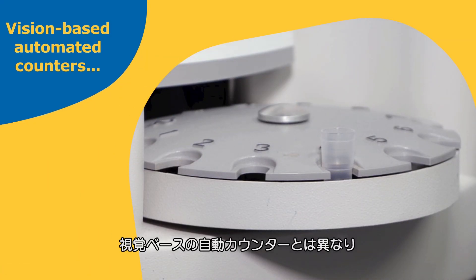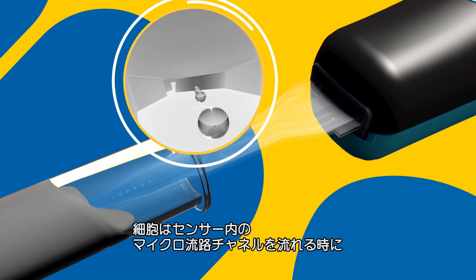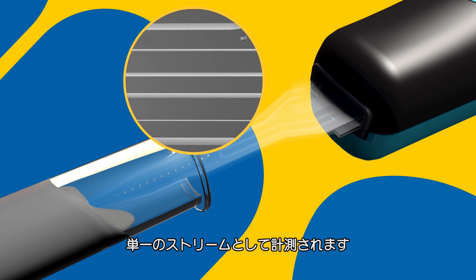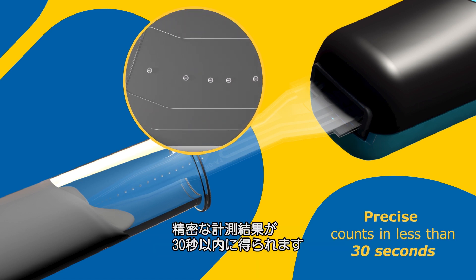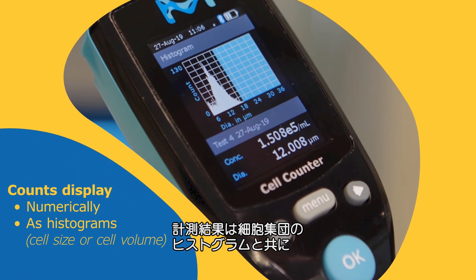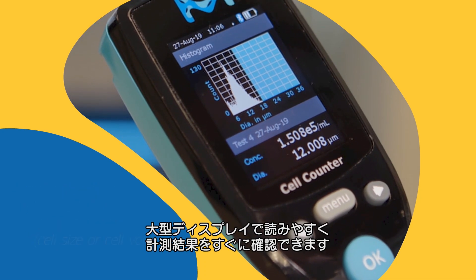Unlike vision-based automated counters, no special and potentially toxic reagents are required. Cells are counted as they pass in a single stream through microfluidics channels in the sensor. Precise counts are returned in less than 30 seconds. Counts are displayed along with a histogram of the cell population by cell diameter or volume, as chosen by the user.